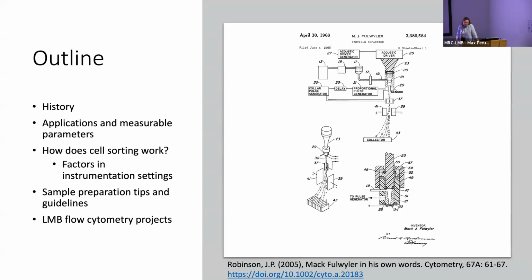The Coulter counter was developed by Walter Coulter, and this was a device used to enumerate and size particles suspended in electrolytes. One of the reasons why they got really interested in developing something with a bit more specificity is that they noticed that a pathologist they were working with was incorrectly using the machine. He was essentially incorrectly identifying what he thought was an immature red blood cell using the Coulter counter.